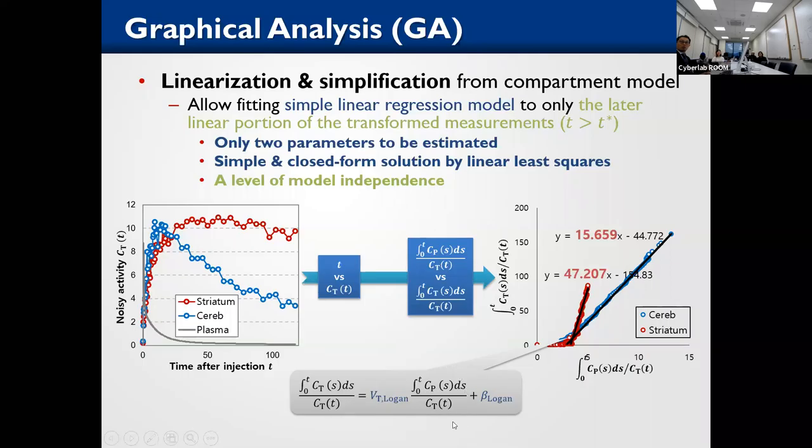X-axis is this data, y-axis is this data. Then this curve has very characteristic shapes. Firstly, they are curves, but after some time point, they look like a straight line. There is some point where the straight line appears.